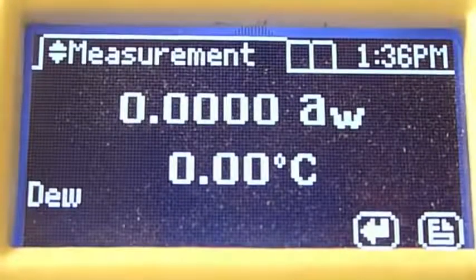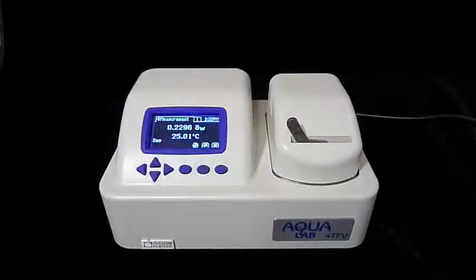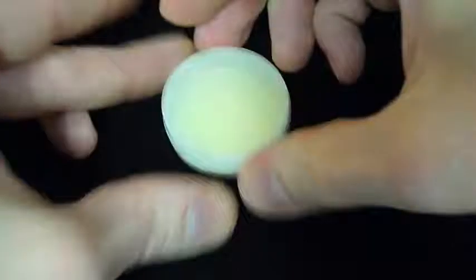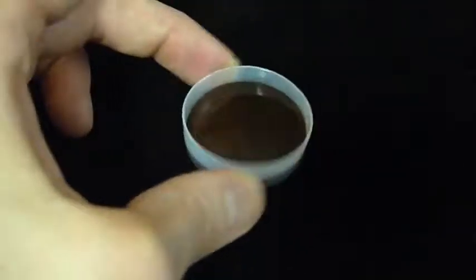Now let's return to the Series 4 that was taking the reading on the graham cracker. Once the read cycle is finished, the Series 4 will beep four times. Each time a reading is reached, the instrument automatically saves time, temperature, date, and user information. The whole process is pretty simple. Your job is to keep it fast, accurate, and clean: fast by making sure sample temperature is close to sensor temperature before you start; accurate by protecting waiting samples with the lid; and clean by preparing the sample carefully and filling the sample cup to just half full.